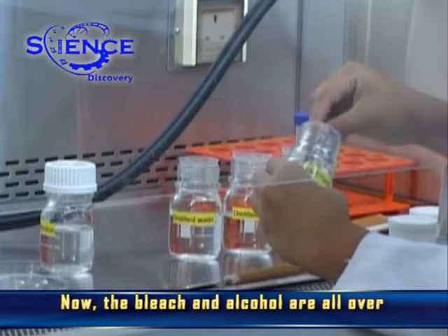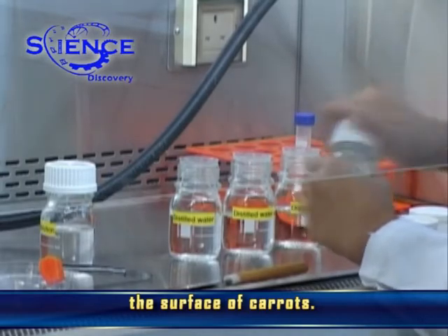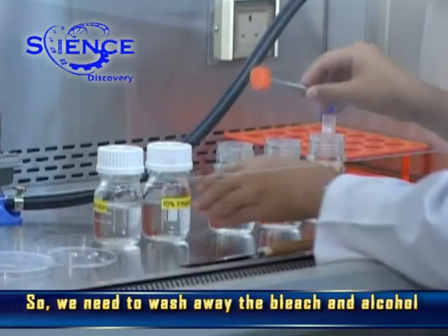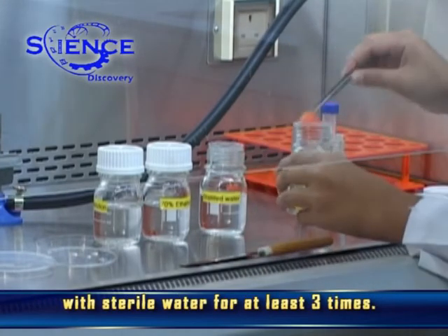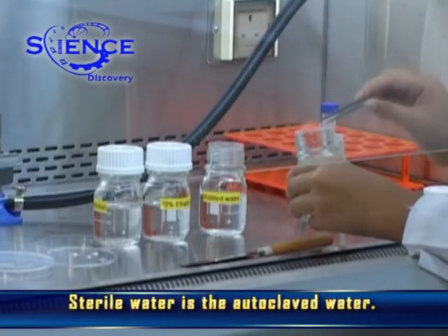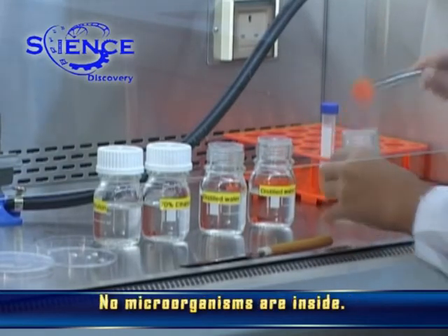Now, the bleach and alcohol are all over the surface of the carrots. So, we need to wash away the bleach and alcohol with sterile water for at least three times. Sterile water is autoclaved water — no microorganisms are inside.